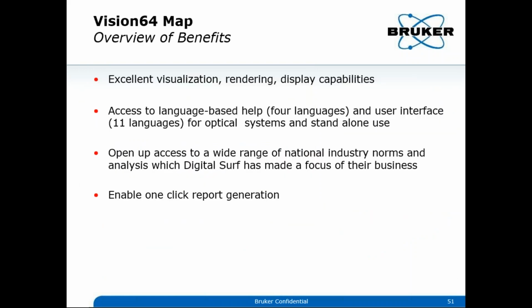So as a summary of the Vision64 Map overview, I have just shown you the 3D images and the multiple language interface, and also the software comes with a lot of standards from different countries, and also the data reporting, and it comes with a lot of modules. You can talk to our sales representative in different countries or regions for more information.